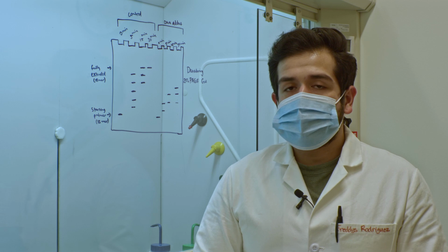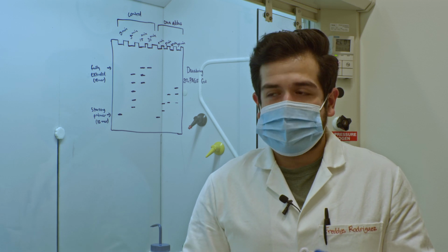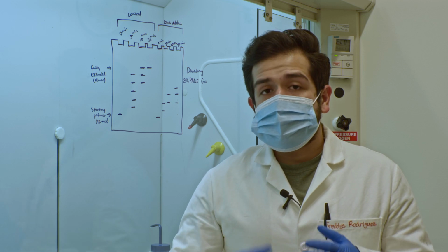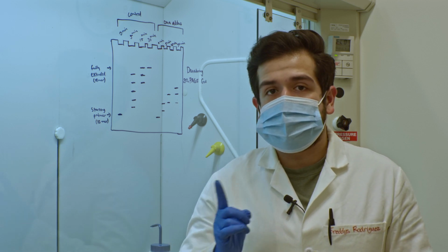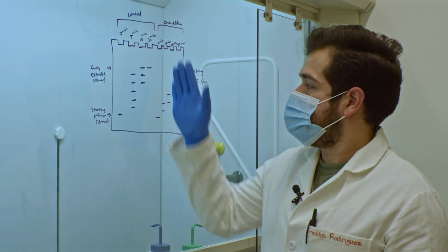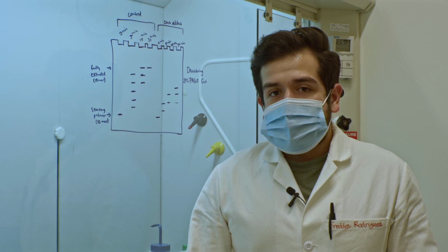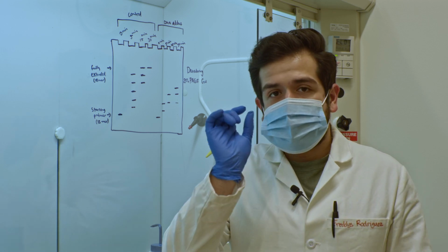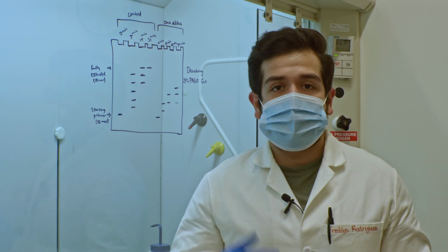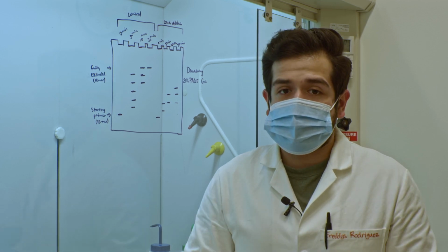The other two kinds of experiments that you can do with this primer extension assay are two very similarly related assays, which are the single nucleotide incorporation assays and the kinetics assays. The single nucleotide incorporation assay uses only one type of dNTP or NTP, and you see its insertion across a DNA adduct site or its addition to other sites along that strand. In the kinetics assays, you also only use one dNTP, at different concentrations, and see how its addition changes over time, in order to know how efficiently it gets inserted opposite the strand, if it's a mismatch for example.